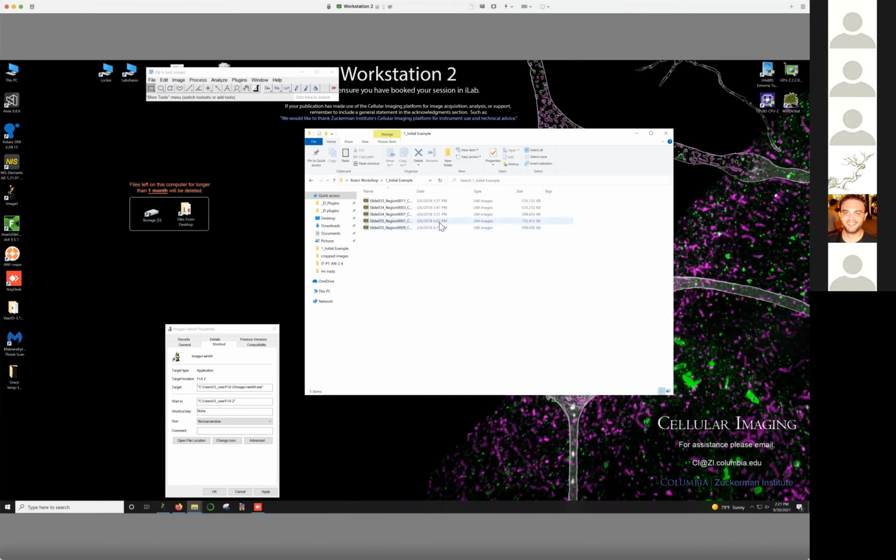So just sort them by order, have a look for the small ones, and then also look for the large ones. Like if there's anything over a gigabyte, it could likely be 2 sections or 3 sections. And if that's the case, that's easier to solve by talking with us about the way you're scanning those sections, because we should be able to get it to a point where you don't have double sections during your scans.